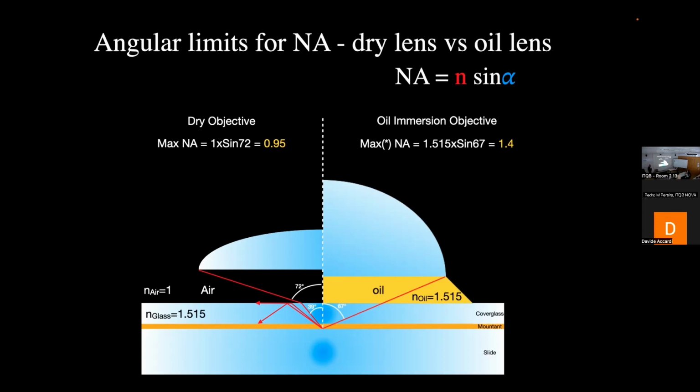So I will tell you. It can actually be 72. But if you do the sine of 72 or the sine of 67, the difference is enormously small. So one is 0.92 and the other one is 0.95, and I will show you in the next slide here.